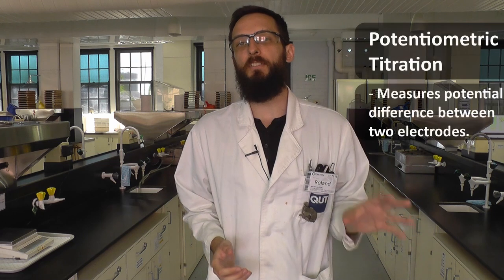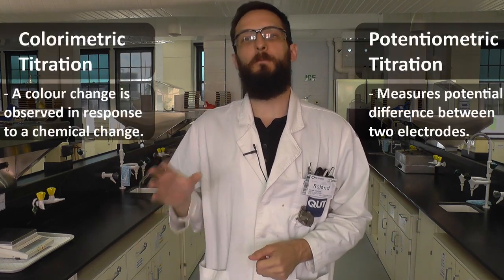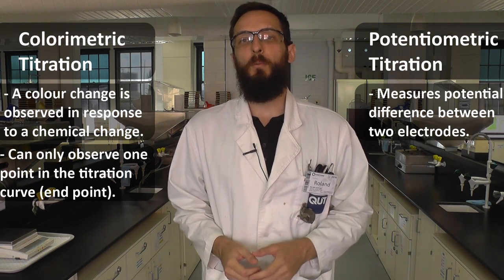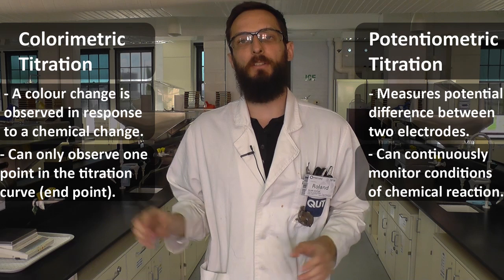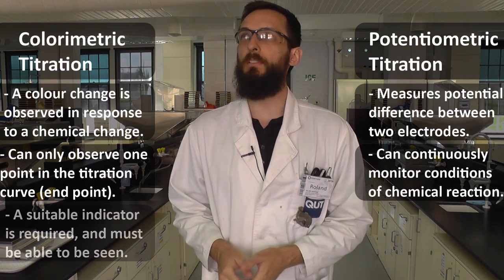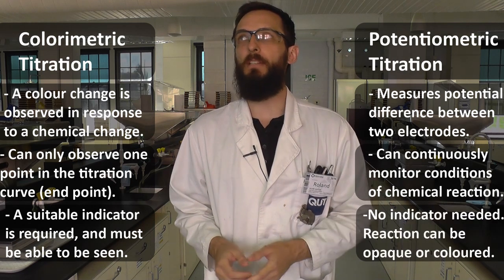Welcome to Experiment 4. In this lab, we're going to be looking at some potentiometric titrations. They differ from colorimetric titrations in that there is no visual indication of an endpoint. What's really nice about a potentiometric titration is we can visualize the entire titration curve regardless of what the solution looks like. We do this by measuring the pH against the volume of the titrant added.